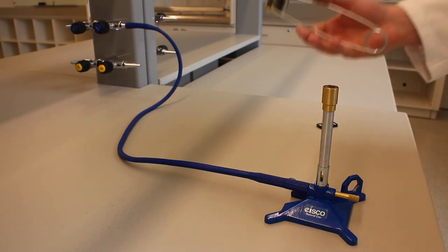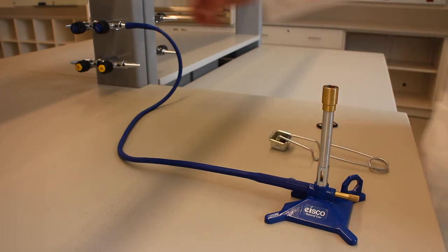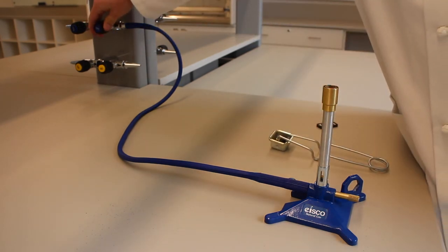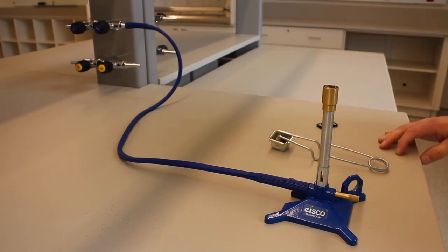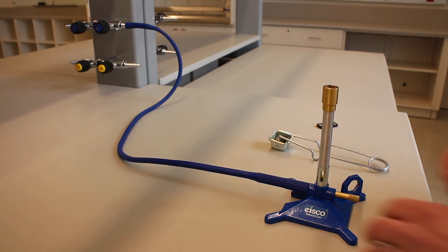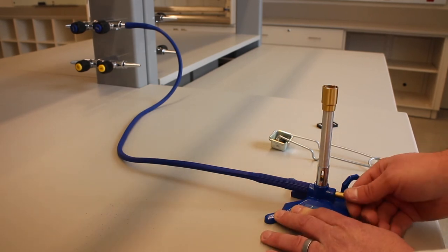If it does not ignite quickly, turn off the main gas flow and let the released gas dissipate before trying to light the burner again. Also ensure that the gas knob on the bottom of the burner is not closed since this will stop gas from flowing into the burner and prevent any attempts at lighting it.